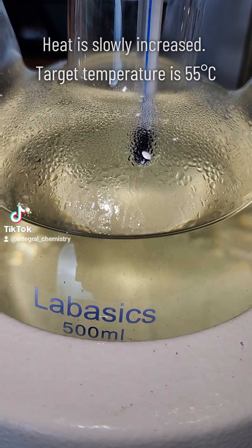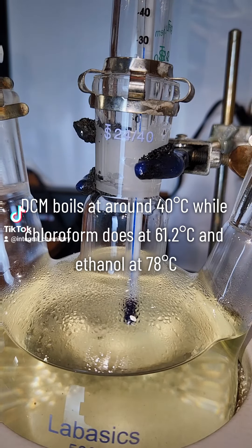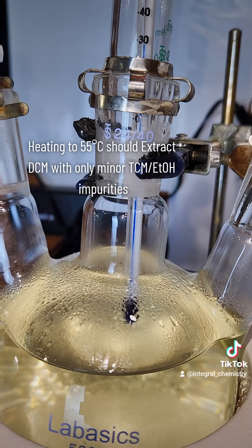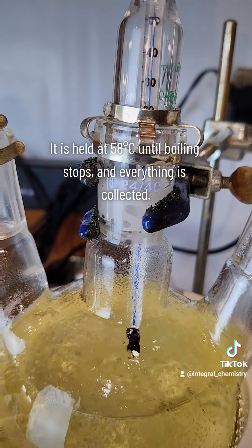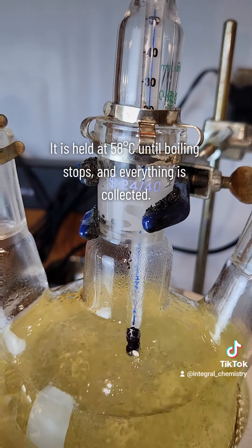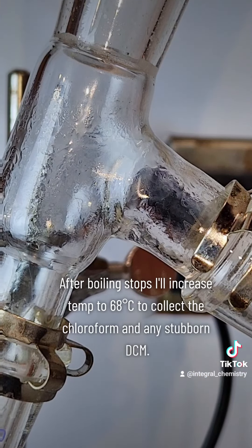My target temperature here is 55 degrees Celsius, and that's because DCM boils at 40 degrees Celsius while chloroform boils at 61.2 degrees Celsius. Boiling at 55°C should distill over just my DCM while leaving my chloroform and ethanol in the boiling flask. Eventually it'll come to a rolling boil, and I just hold the heat below 58°C until the boiling stops.